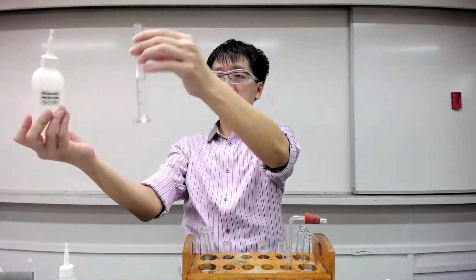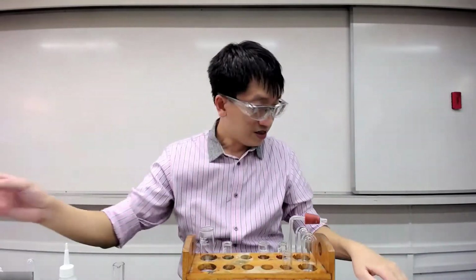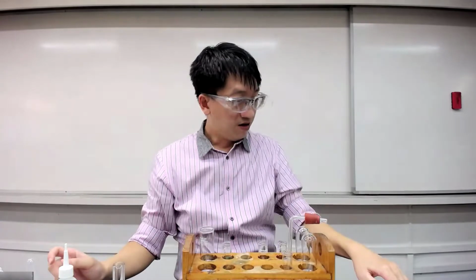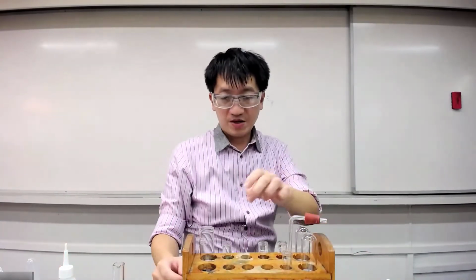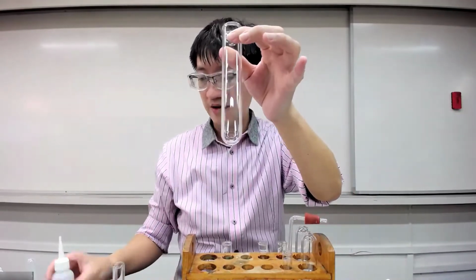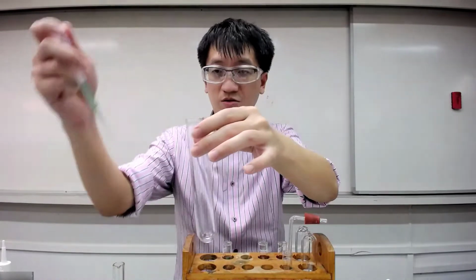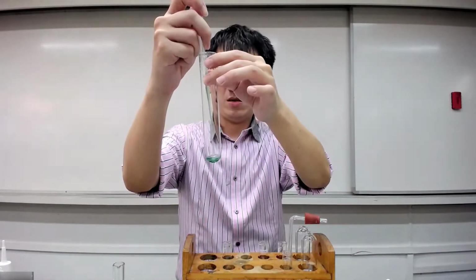Okay, so follow instructions, 6 cubic centimeters of aqueous ammonia. Okay, and then I need to place 2 cm depth. Okay, so in this boiling tube, I'm going to put in 2 cm depth of FA1.